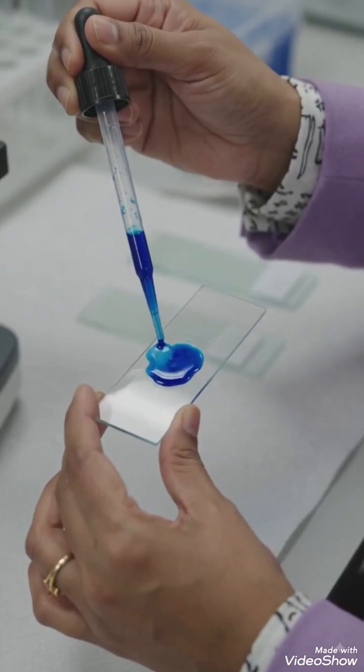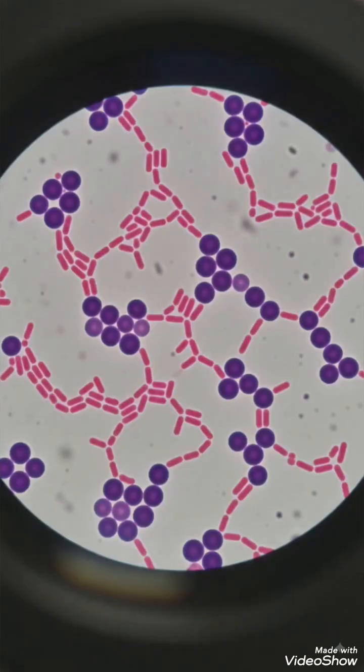Staining techniques are indispensable tools in microbiology. They help visualize microorganisms. Through the microscope, the invisible microbial world becomes visible.